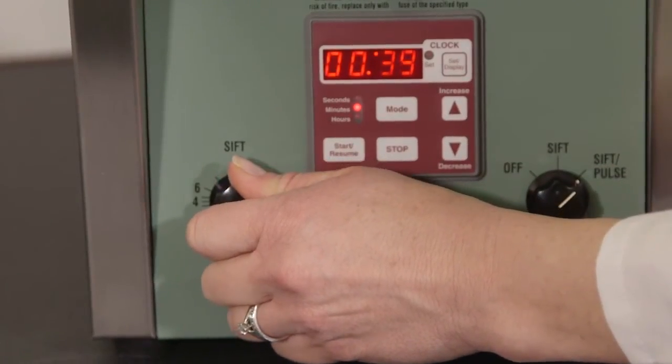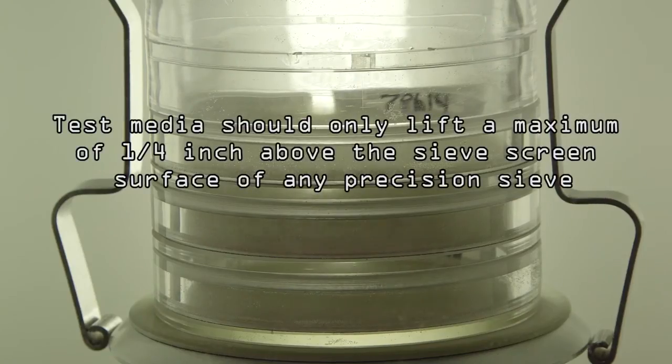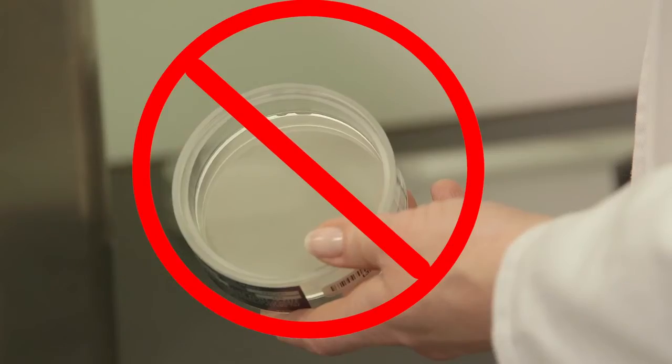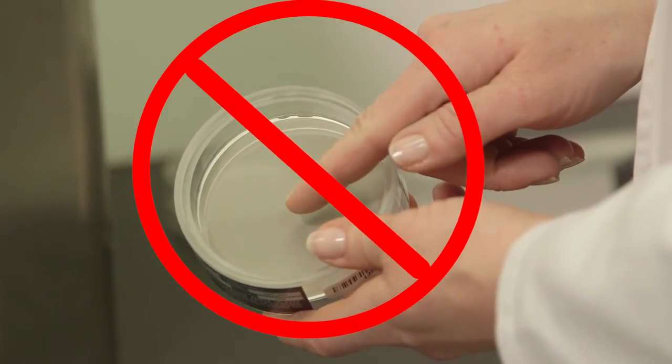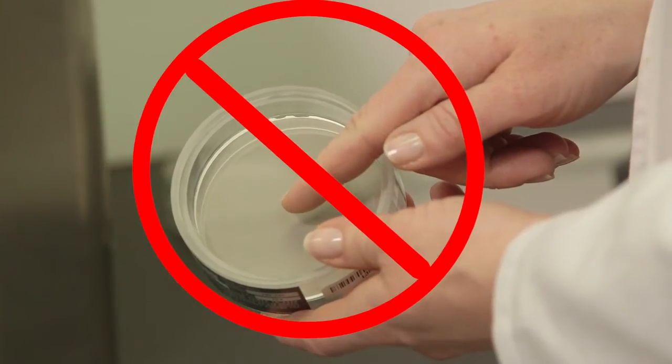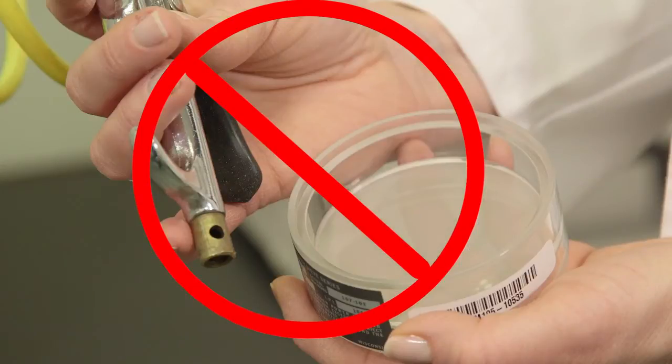Gradually increase the amplitude until the test media lifts a maximum height of one quarter inch above the screen surface. Never touch the sieve mesh with your fingers or any objects other than your sample. Acids in your perspiration will permanently stain or damage the mesh.